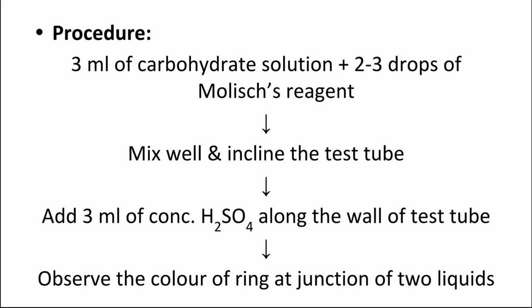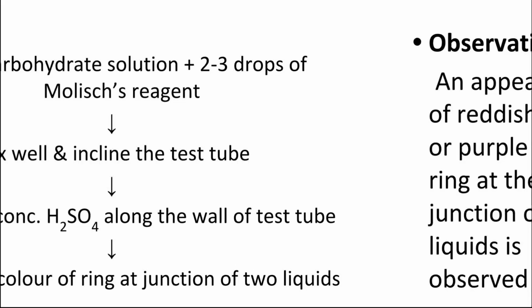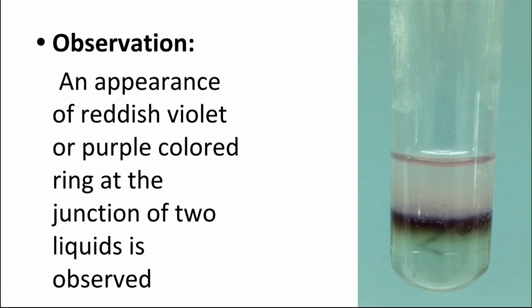Now at the end, what you will see is the violet color ring. This will be the observation. When these two liquids are combined together, there will be a formation of a reddish violet or purple color ring.